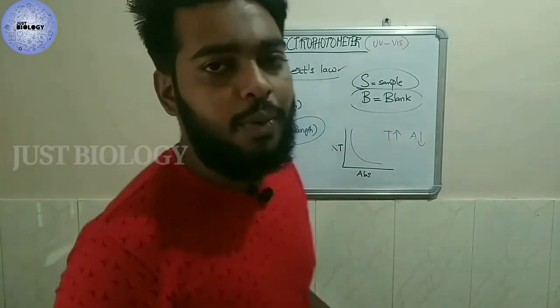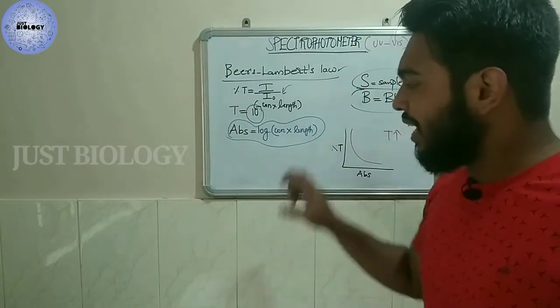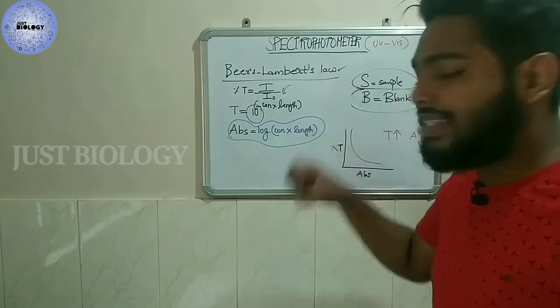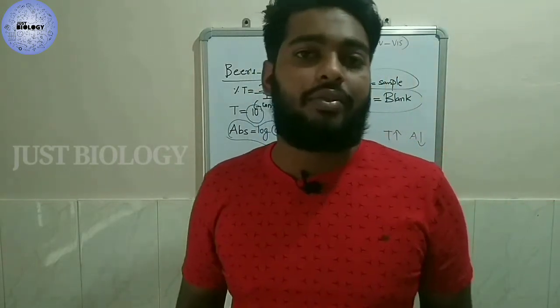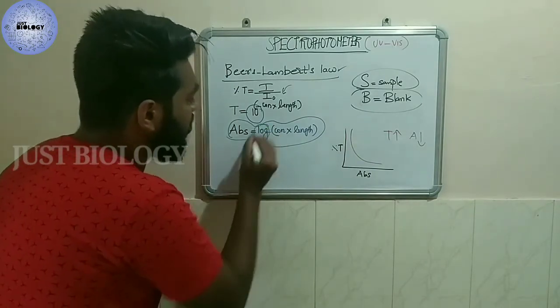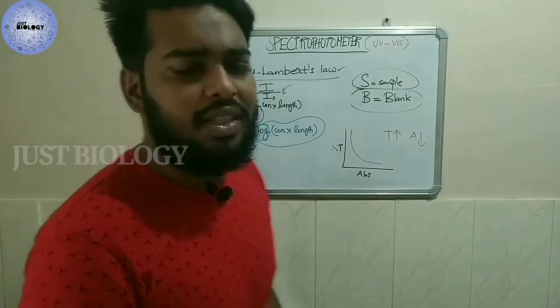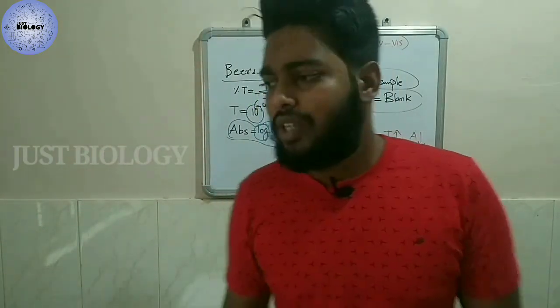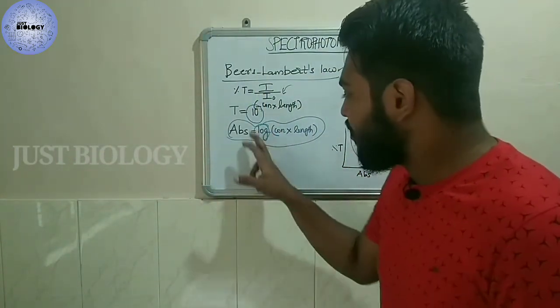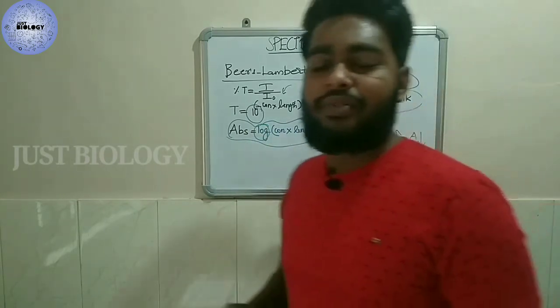Again we have to rearrange further for the exact value. We need to get the exact value that we are looking for. For that we have to remove this log. Why? Because logarithmic calculation is more difficult when compared to the normal. That's why we have to remove this log, or avoid this logarithmic form.